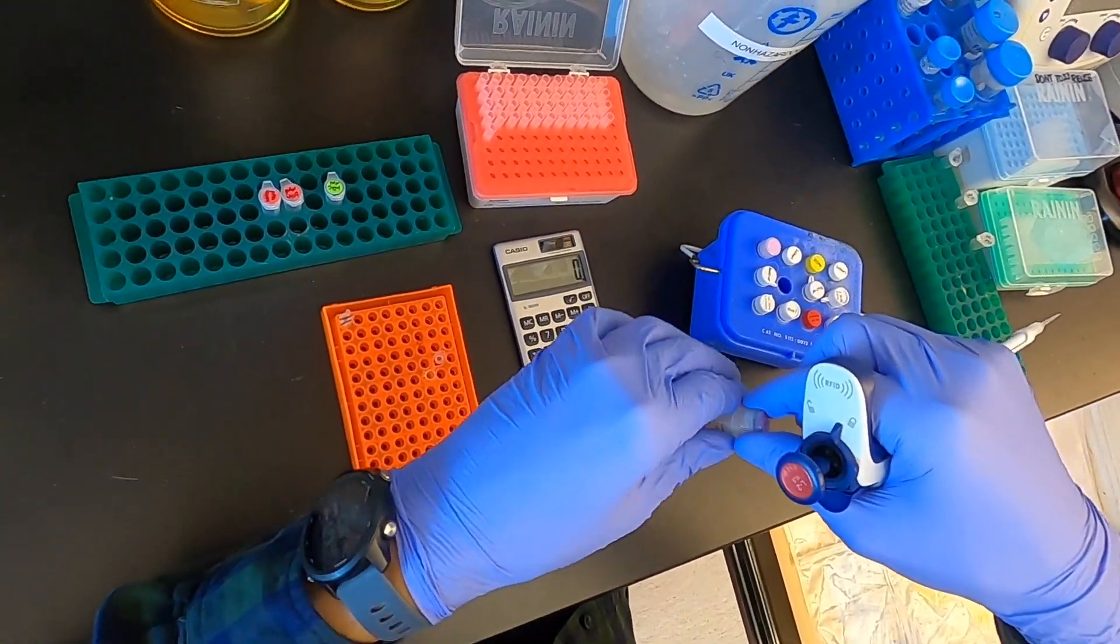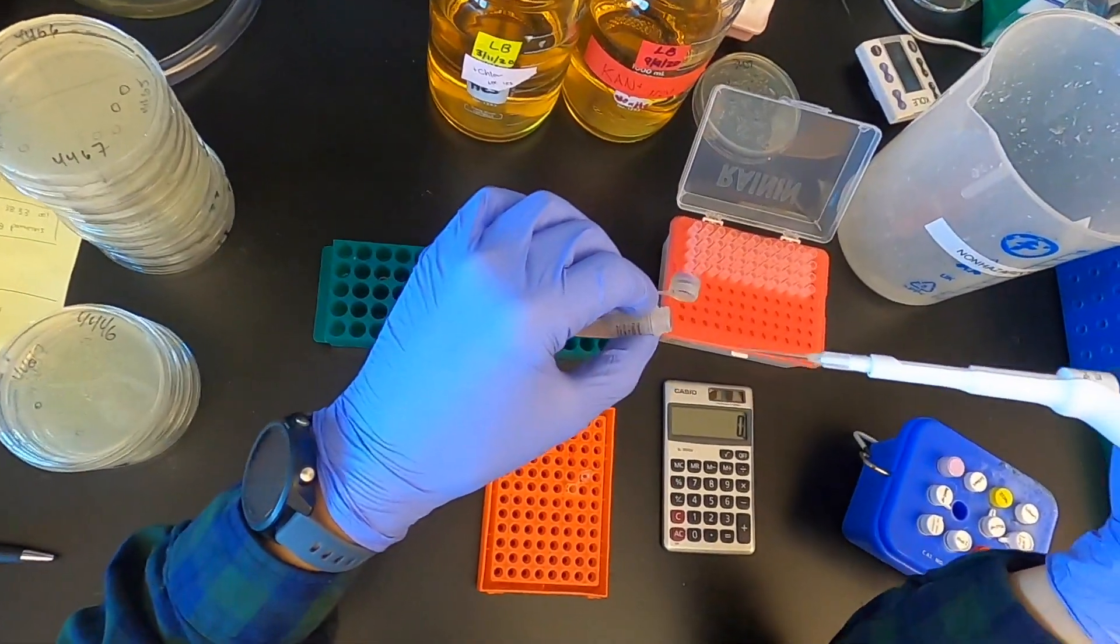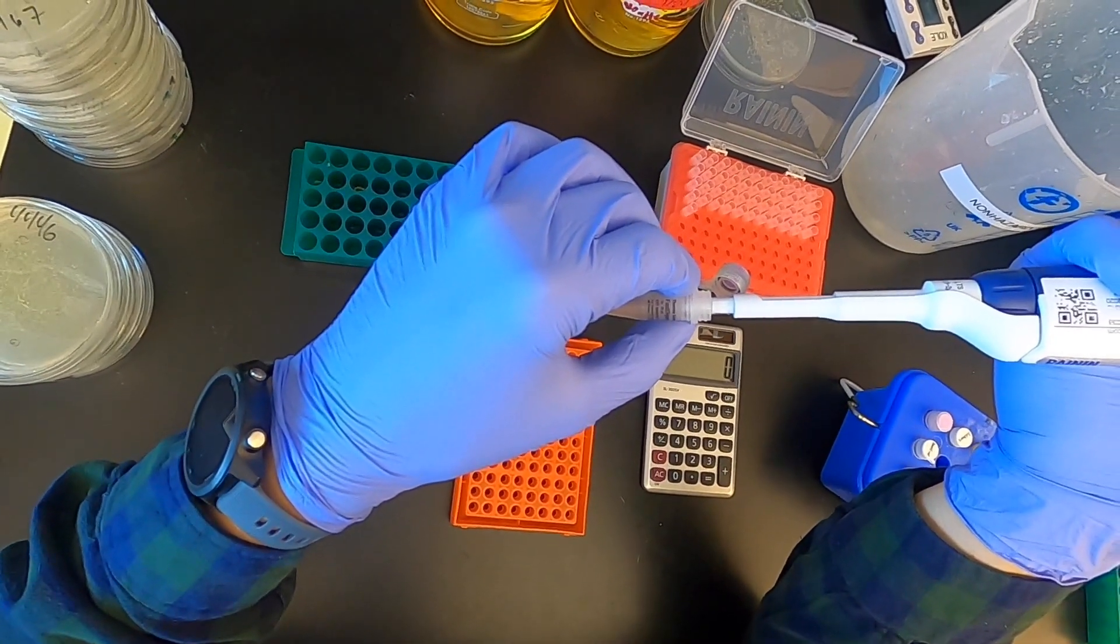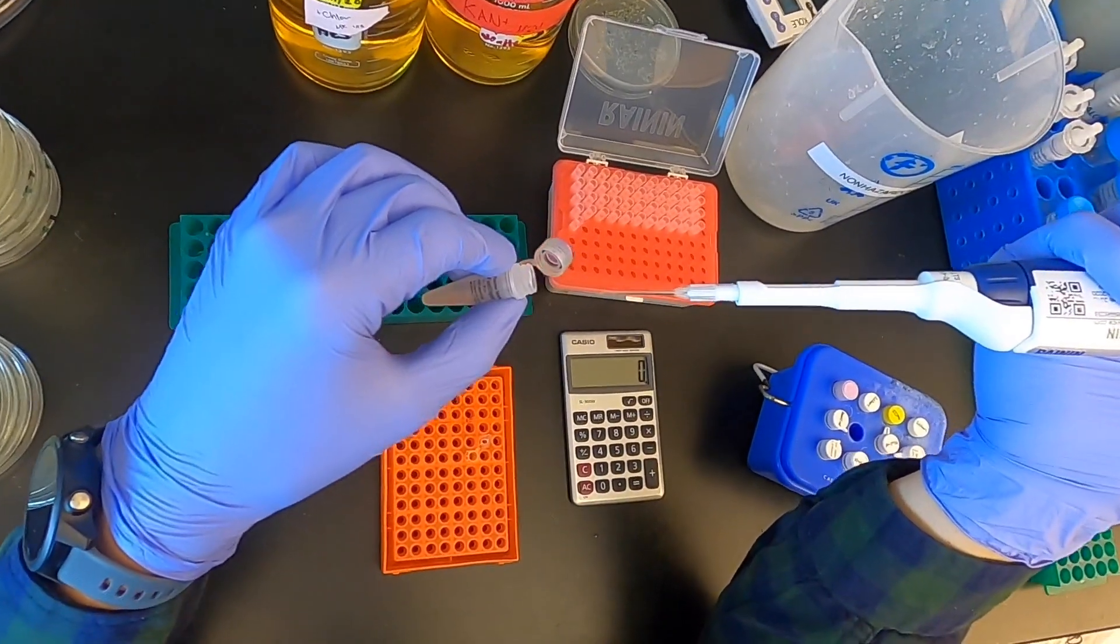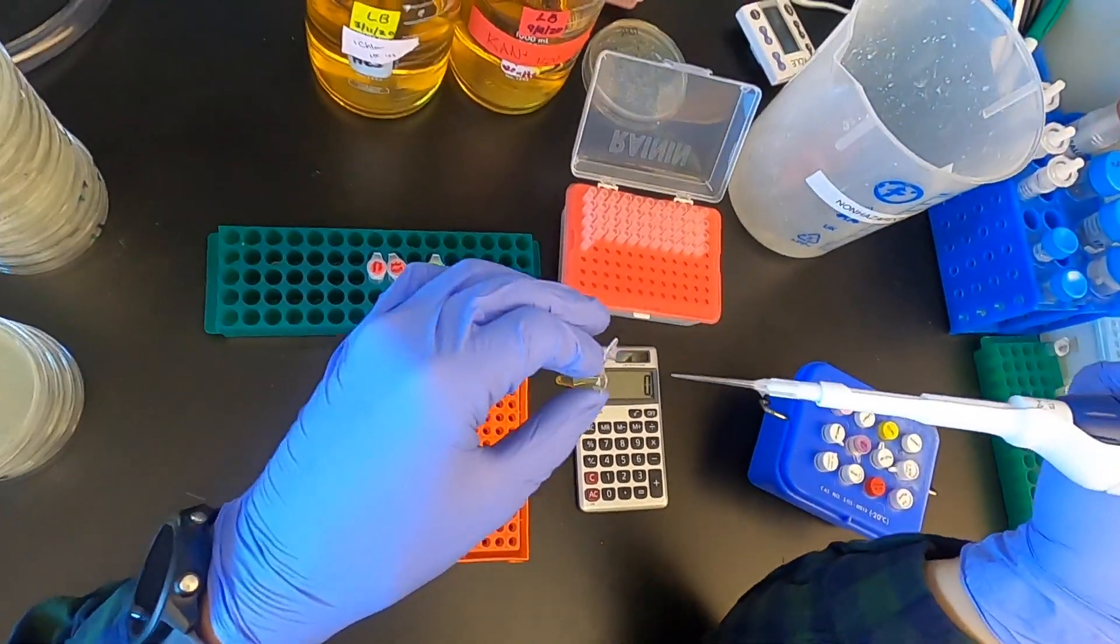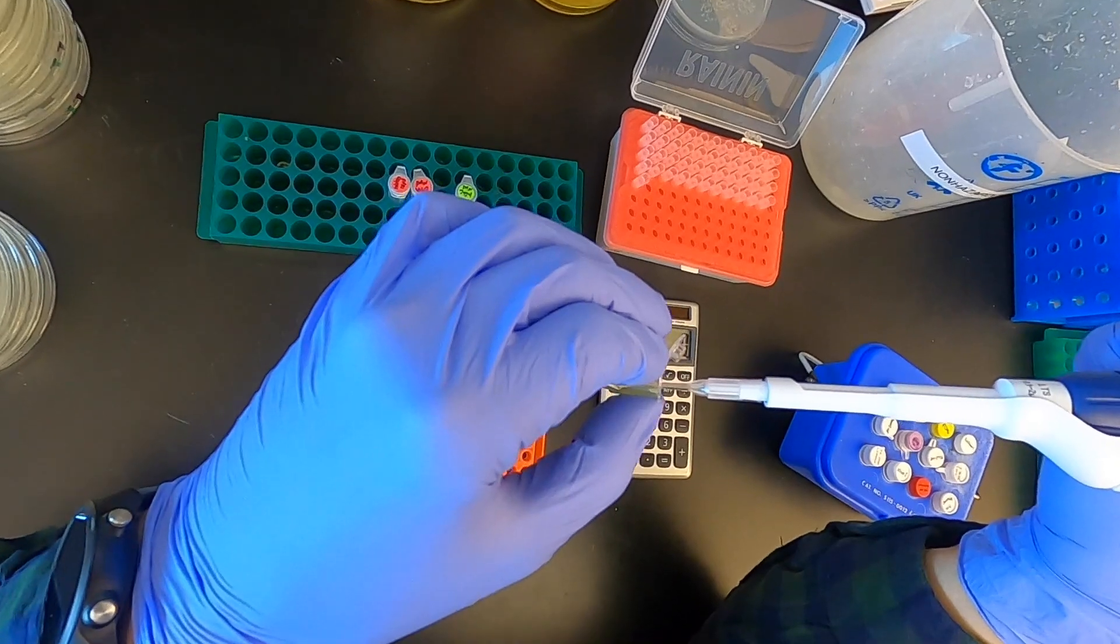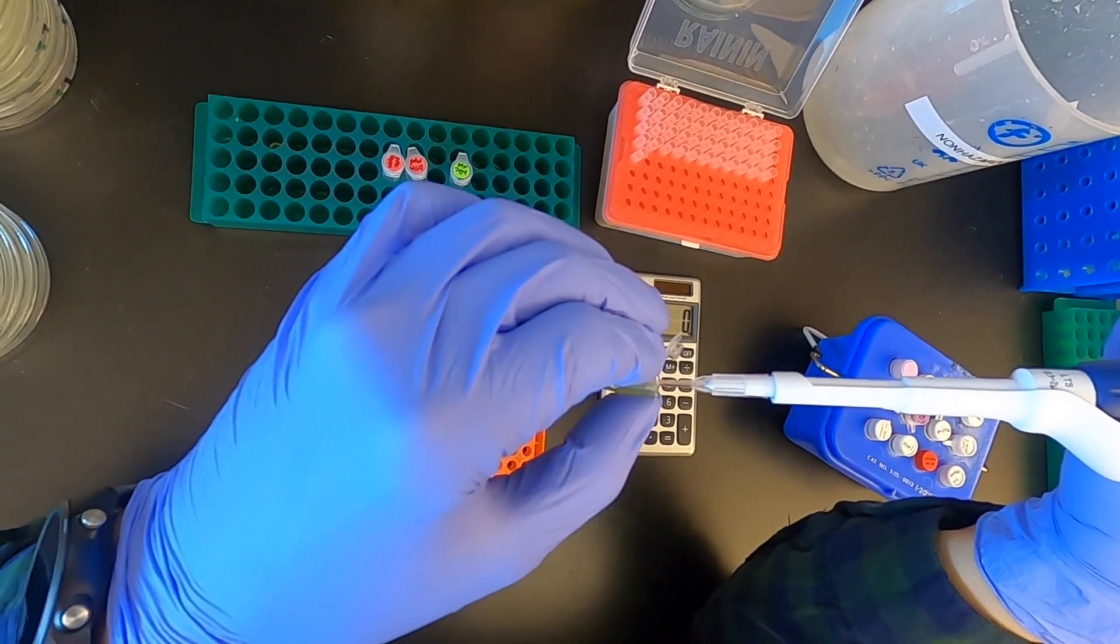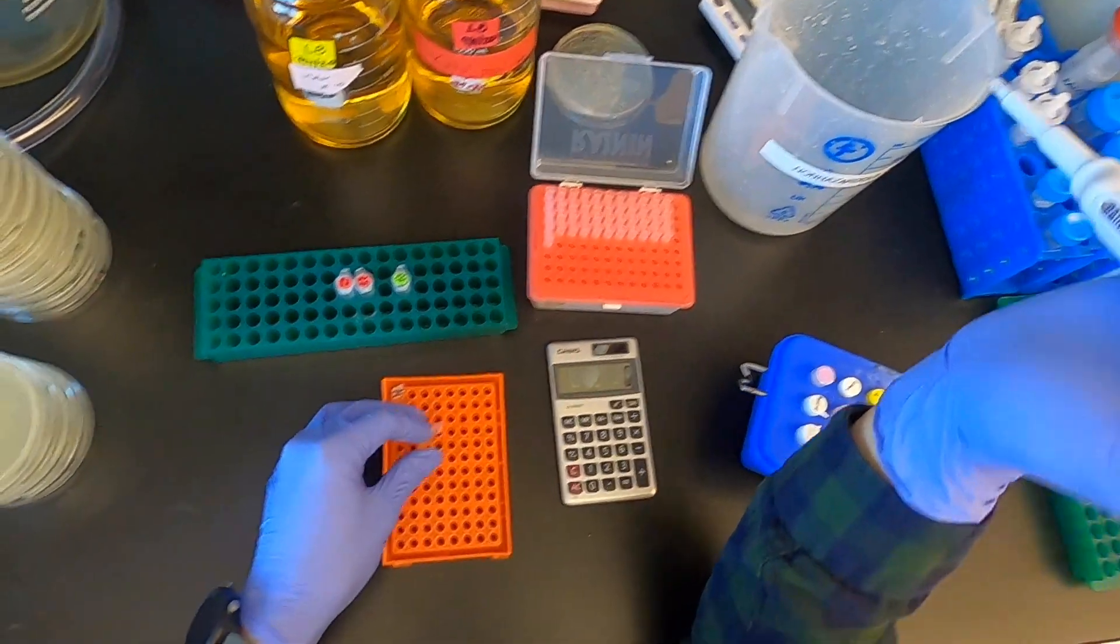Next I'll add my restriction enzyme, ESP3I. Again, visually confirming that I have 0.25 microliters in there. I'll even push to the second stop there to actually get that liquid out since it is pretty viscous.